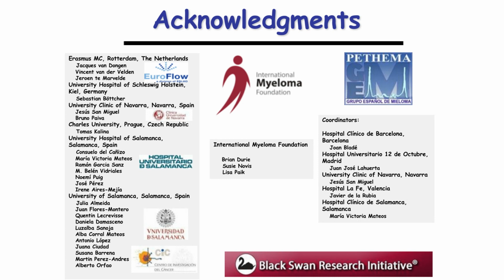Thank you. Our next question is, the NGF multiple myeloma MRD kit is not validated by the FDA for clinical trials, but NGS is. Why so, and what efforts are made to change this? That's a very interesting and also relevant question. It's for sure true. We are currently putting the data together to submit the NGF methodology for approval both to the FDA and to the European Medicines Agency. And that is underway currently.